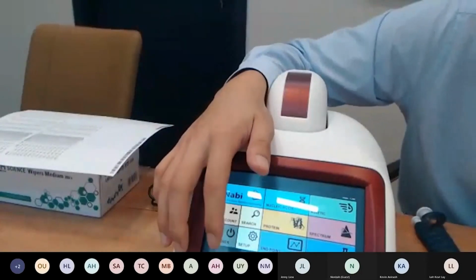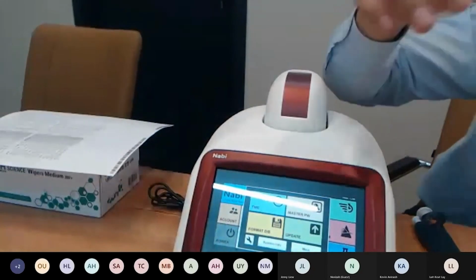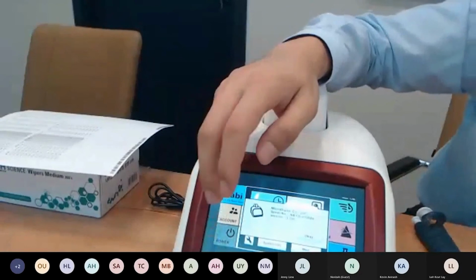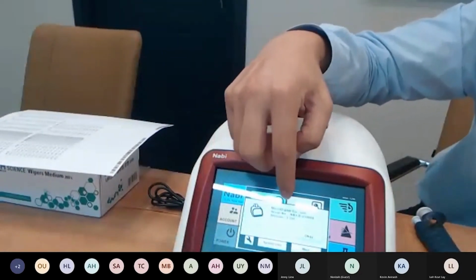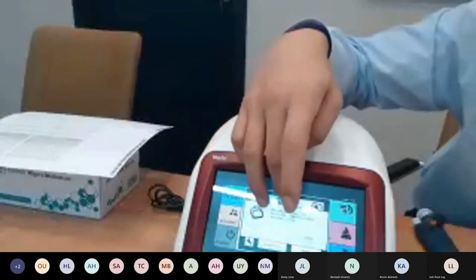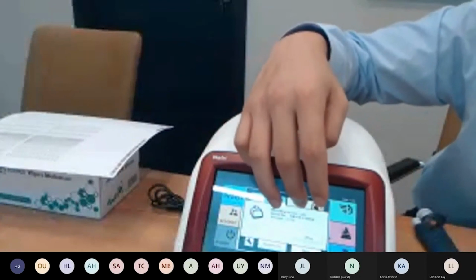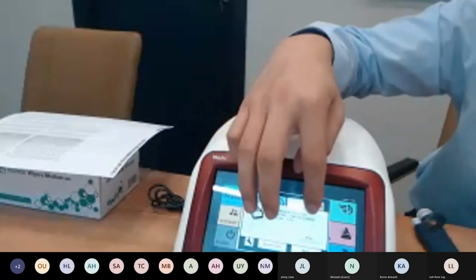As for the setup, there's not much that non-technicians can do, but if you ever need to look at the system information, all you have to do is press this, and you'll be able to see the version information for the UI, the software. You'll be able to see the serial number and who it's made by. So serial number, this one is MB1E22108004, and the version is 3.705.